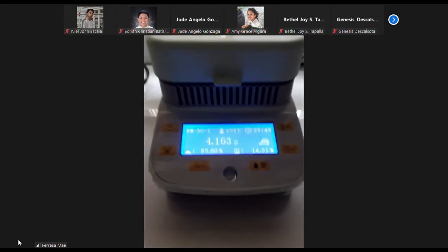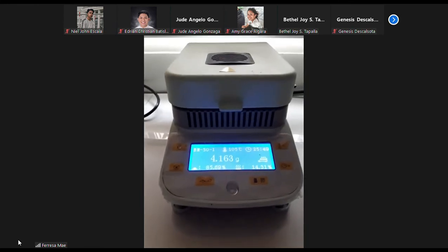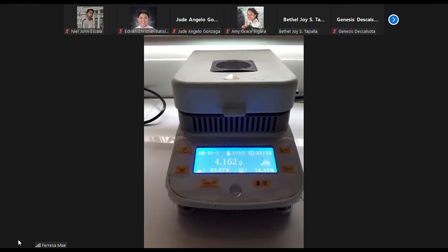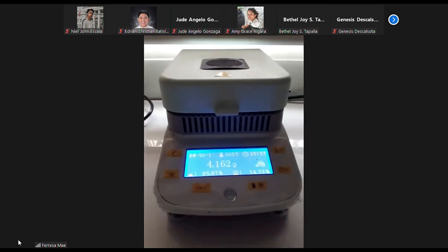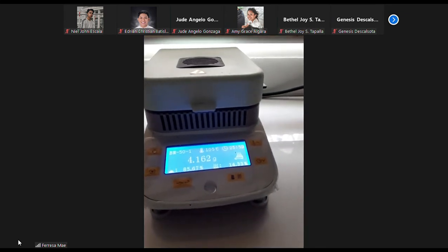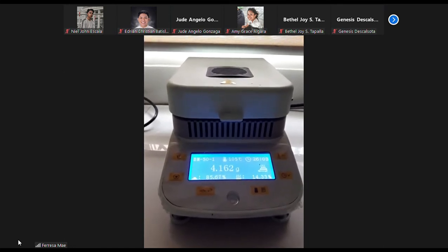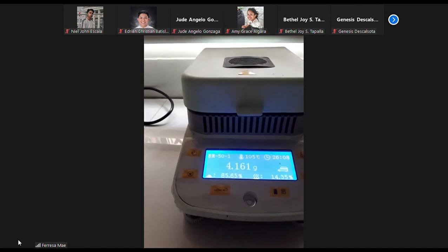Miss, Yes, Bethel? Sa pag-test sa moisture kag water activity, Miss, hindi na need ang 3 trials every sample, Miss? Oo, yung 3 trials. Ang aton ni nang nainlain pero sa actual is 3 trials gid. Okay, Miss, thank you, Miss. Oo, you're welcome.